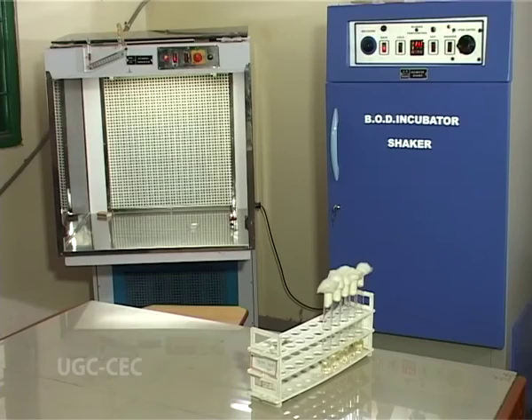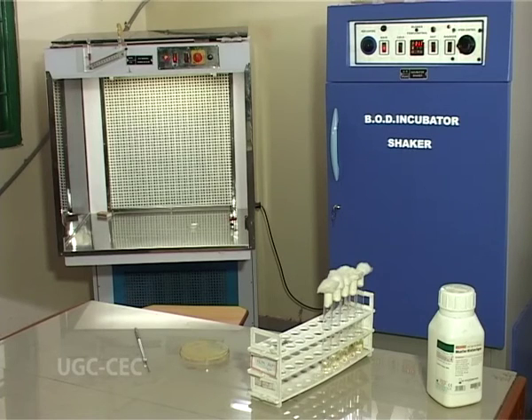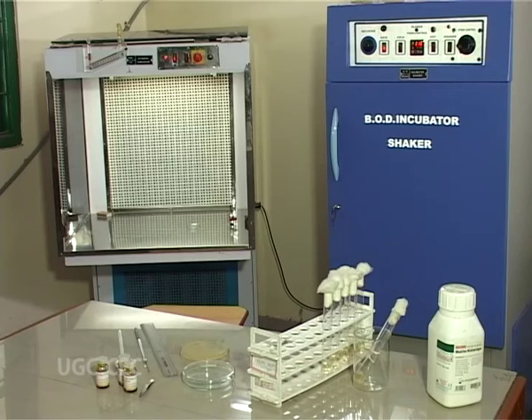The requirements include the nutrient broth in 20 ml culture tube, a pure plate with different bacterial colonies, an inoculating loop, Müller-Hinton agar powder. It can either be manufactured or it can also be prepared taking the different composition. It will also include the Petri plate, the autoclave, a ruler, antibiotic discs belonging to different antibiotics like streptomycin, ampicillin, tetracycline, etc. The forceps and the spreader, 18 to 24 hour old culture of bacteria, laminar hood, spirit lamp, incubator with shaker.